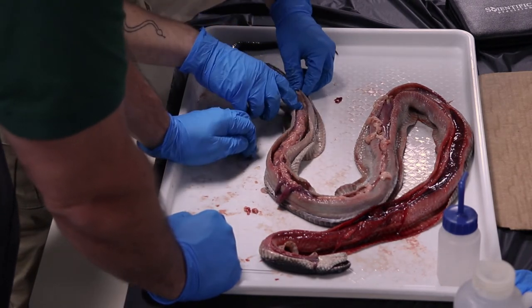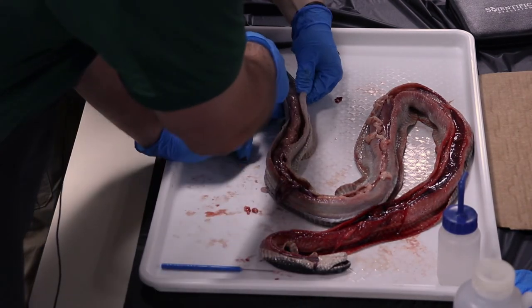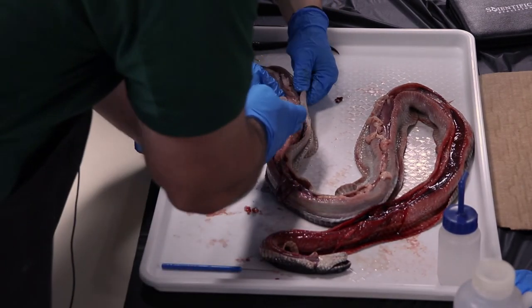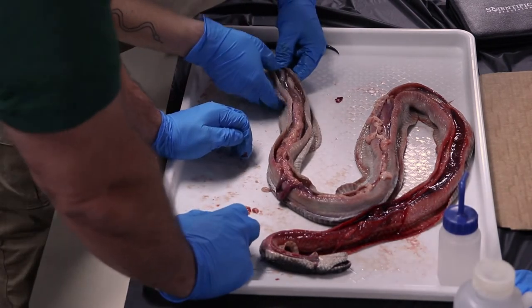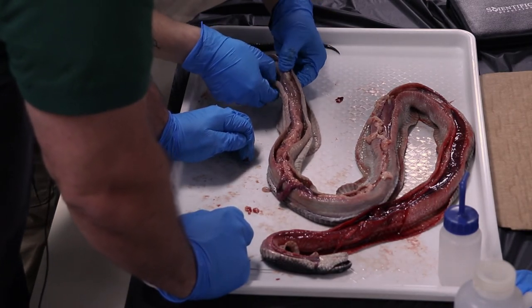Looks like it. Looks like a clear sac. Which is oftentimes what the bladder or something similar looks like. It's like large intestine down here, maybe? Yeah. So we got this mass of small intestines. It's leading directly into a single large intestine. Trying to find the kidney.